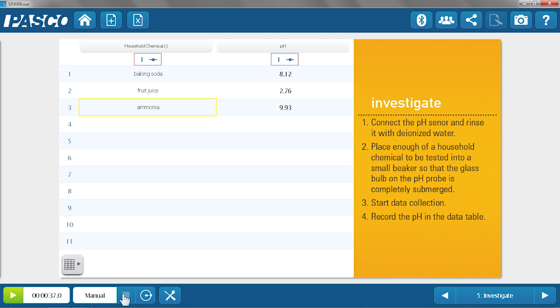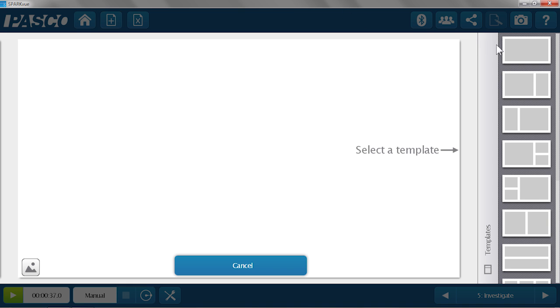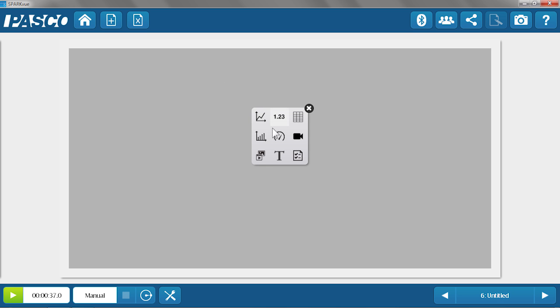If I wanted to, could I edit this SparkLab and have a more visual way of seeing the data? Could I make a bar graph? Yes. Right now we have it in a nice table, but some of your students might appreciate or understand this more in a bar graph. So I'm going to add a new page. I'm going to select the template. I just want the whole page to be the bar graph. I'm going to select the bar graph icon right here.